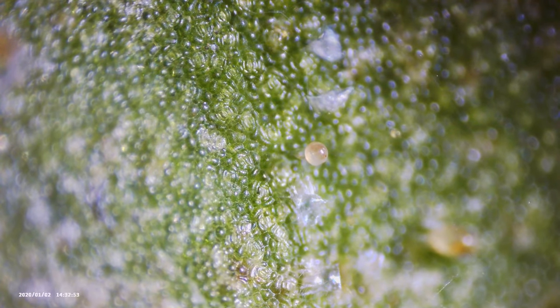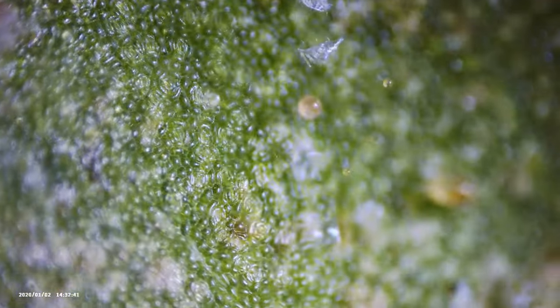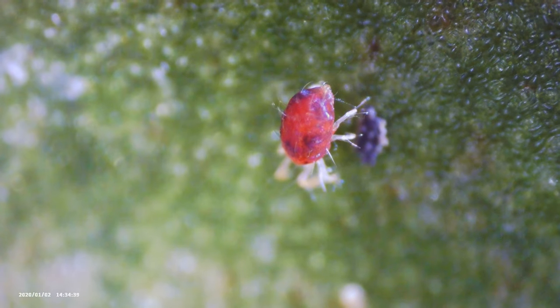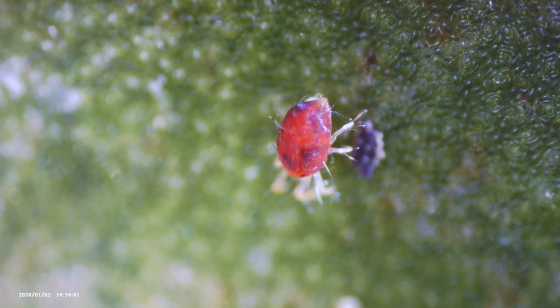If you can see those little pearl-shaped things, those are going to be the spider mite eggs. They look like perfect little spheres — kind of cool, almost pretty — but I hate these guys because they really destroy my plants and you never notice them until it's too late. All those skeleton-looking things are from when they change forms. They hatch from the egg as a larva, go through their nymph stages, and shed their exoskeleton as they mature into their final form.